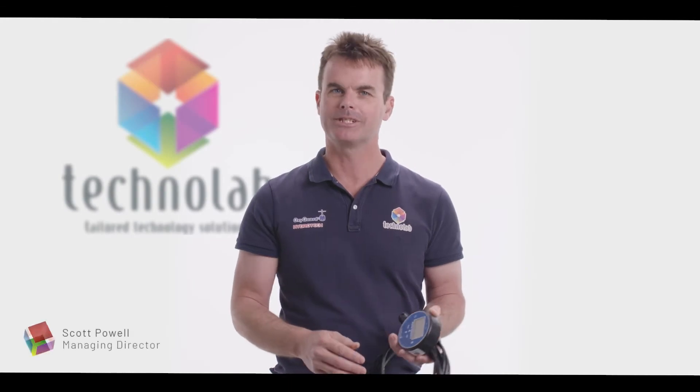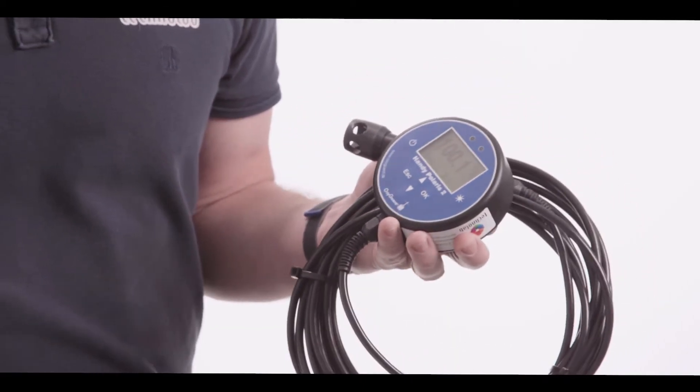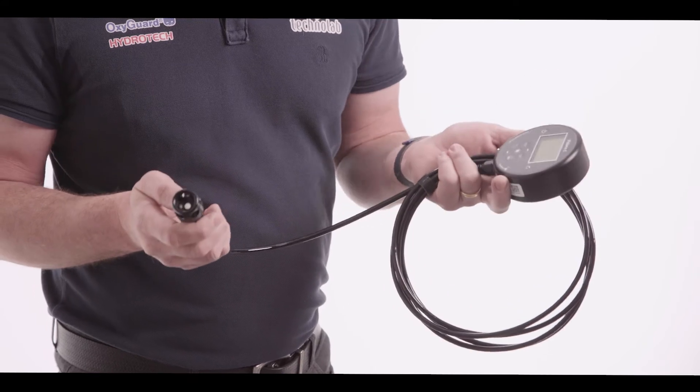Hi, I'm Scott from Technolab. Today I'd like to show you the new upgraded model of the ever reliable OxyGuard Handy Polaris 2, which has been around since 2013. The new model looks similar to the original Polaris and has the same robust, easy-to-use galvanic dissolved oxygen sensor.